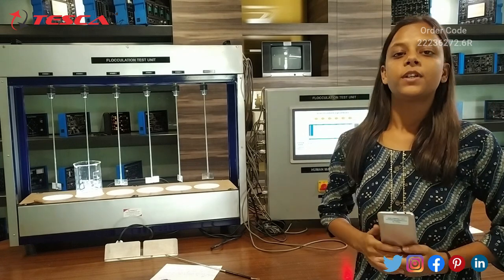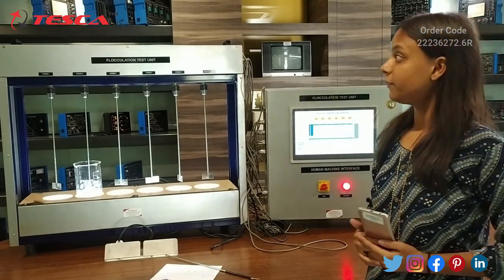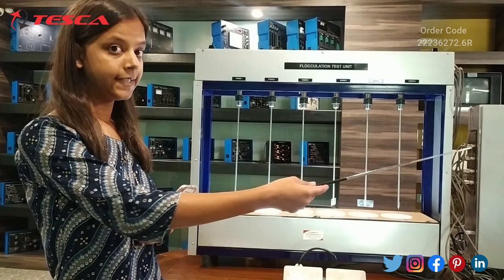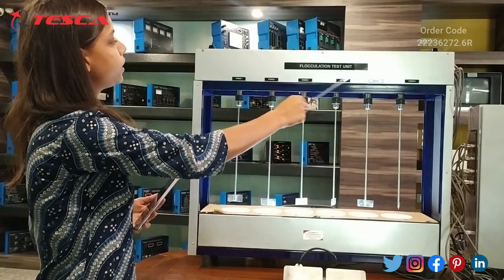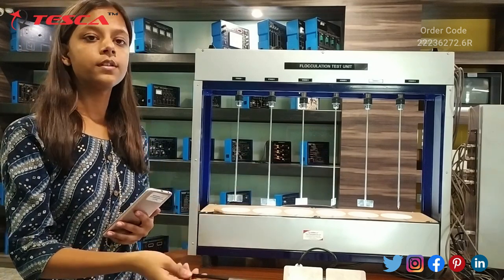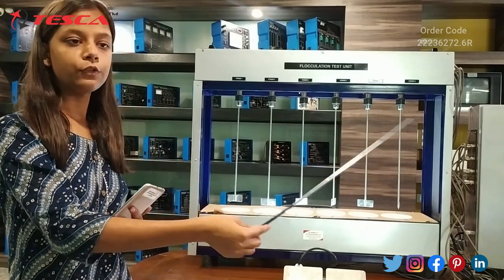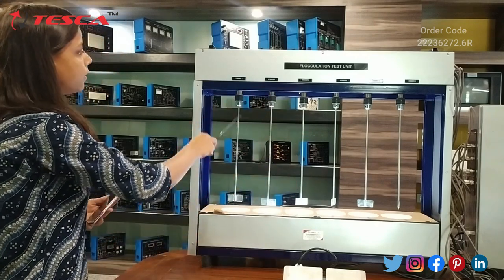Hello everyone, welcome to Tesca Technologies Private Limited, Jaipur. My name is Monika and today we learn about the flocculation test unit. Before going to the working of this unit, let's see the components. Flocculation is a process by which a chemical flocculant is added to the water so we can remove dirt particles from water.